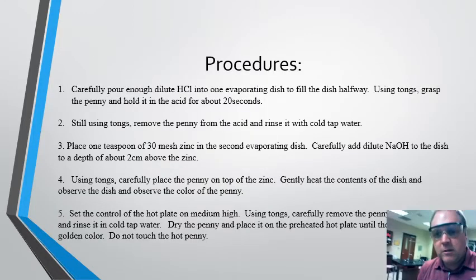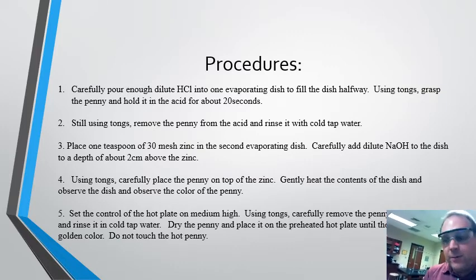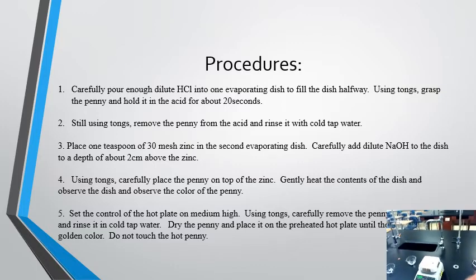Okay, so I'm going to take a moment here and walk you through your lab procedures. When you guys come into lab tomorrow, you're going to come to your lab stations and you should find the following pieces of equipment out there.